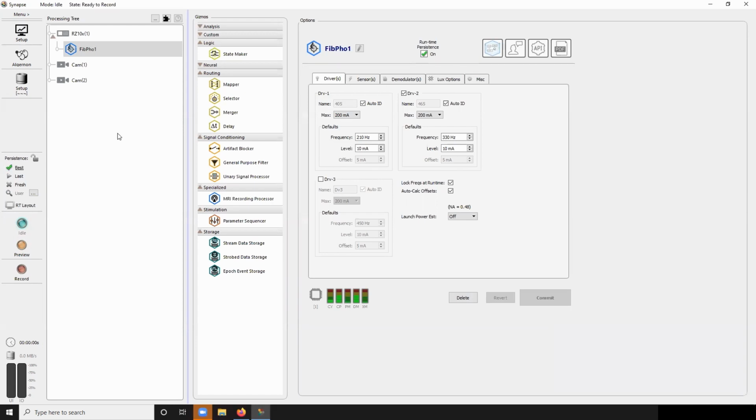It's not like it's calculating the signal any differently. A lot of this is in the manual. Actually, the whole thing about persistence and stuff is in the Synapse manual, not the photometry user guide. But everything we talked about is in the fiber photometry user guide in reference to the RZ10x and the fiber photometry user Gizmo.